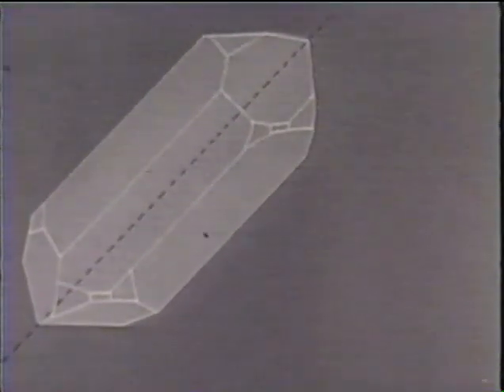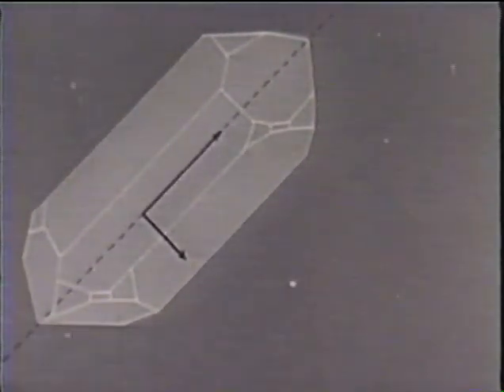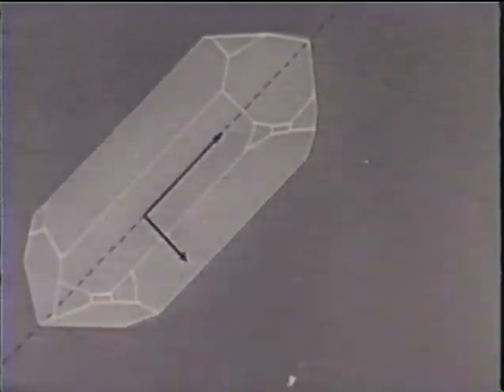Quartz forms hexagonal crystals. When viewed through the sides, they're birefringent, with vibration directions parallel and perpendicular to the axis. In quartz, the vibration parallel with the axis has the higher refractive index.